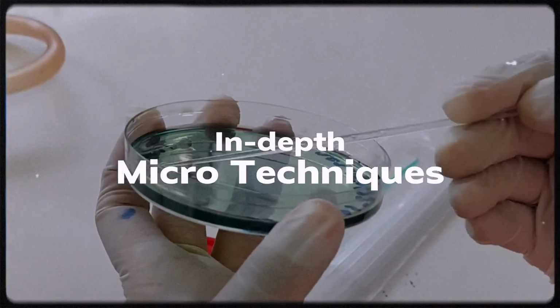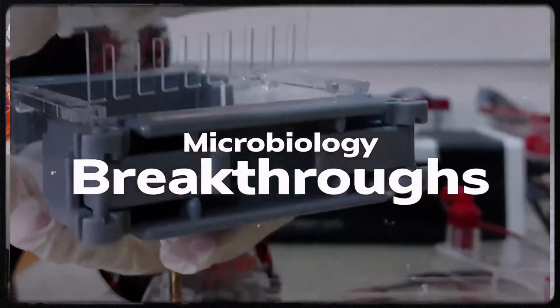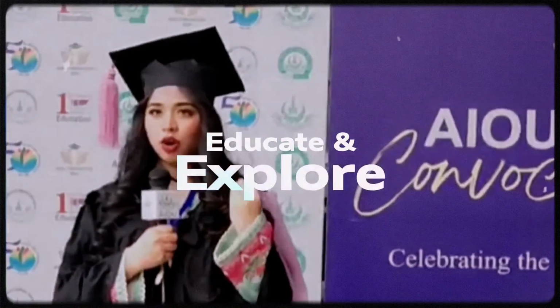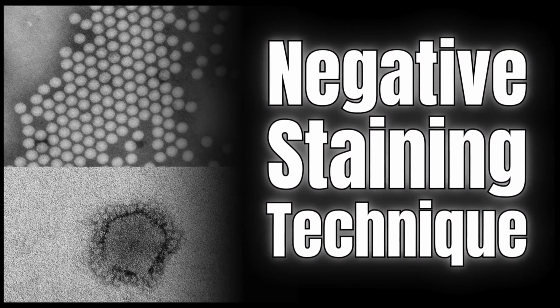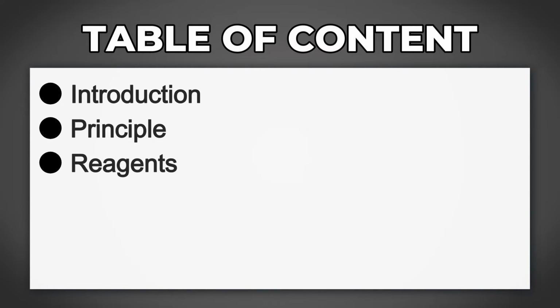Let's explore in-depth micro techniques and uncover groundbreaking insight together on this educational journey into the fascinating realms of microbes. Negative staining technique. Table of content: introduction, principle, reagents, procedure, results.